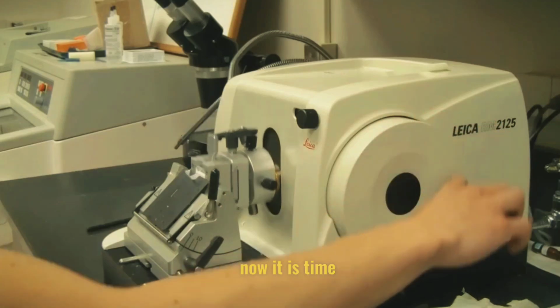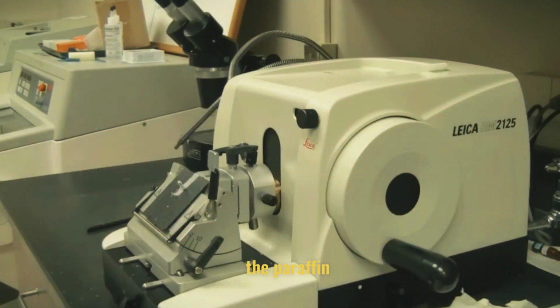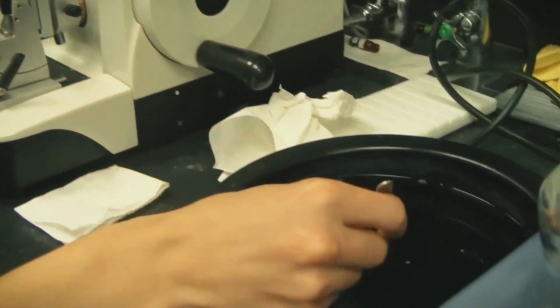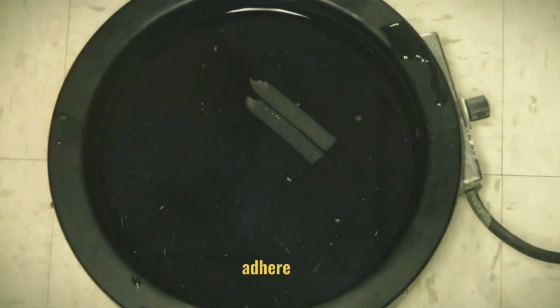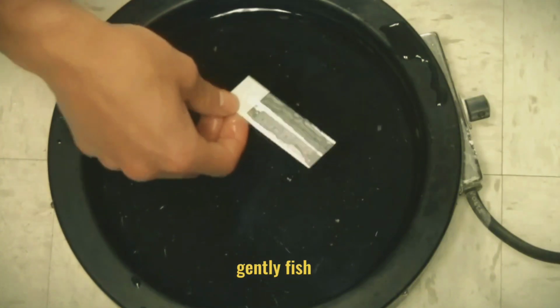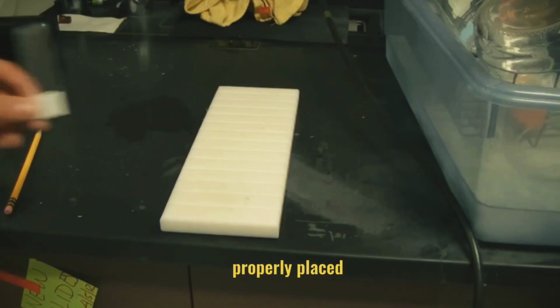Now, it is time for microtomy. Using a microtome, slice the paraffin block into thin sections. After that, adhere these sections to glass slides using a suitable adhesive. Once attached, gently fish out the sections from the water bath to ensure they are properly placed on the slides.